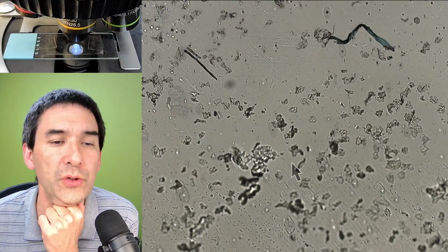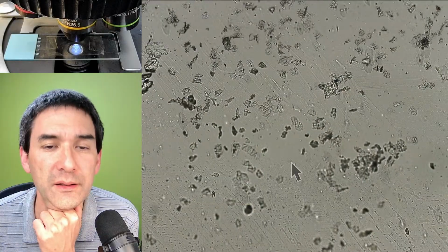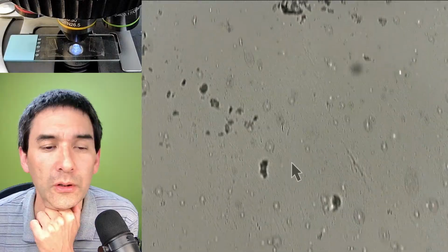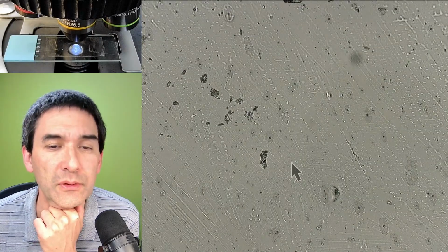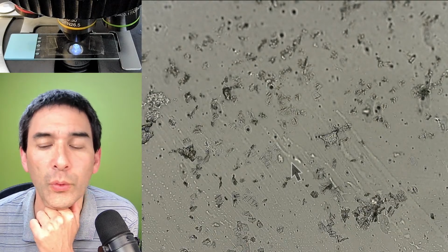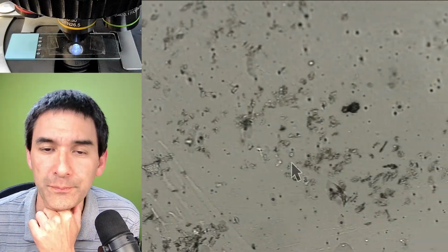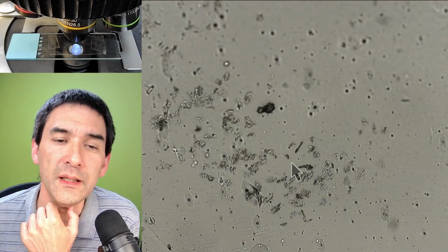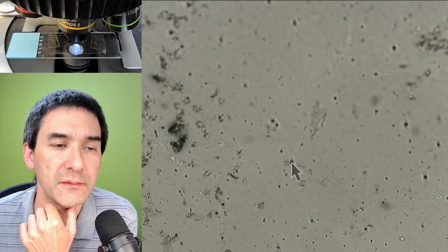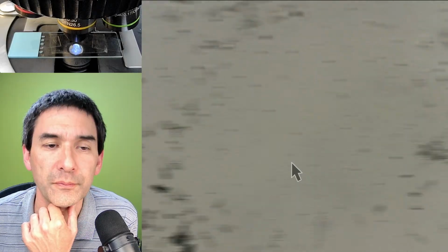So I'm going to show you a little trick how you can make the face mites, if they're present at all, more easily visible. You directly add a little bit of oil, and this will make the skin cells go transparent, but the face mites, if they're present, will be visible much better.